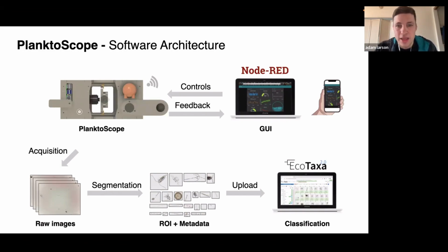You're not really reliant on concentrating your sample, because even if there's not much in the images, the segmentation will pull out anything of interest and then store that as an object on the machine. And this way, it's nice because, say you're just interested in these objects, you can extract those plankton objects with the metadata and store those, and then ditch the very large raw images. Say if you're on a sailboat or something and you don't want to have to store gigabytes of data.